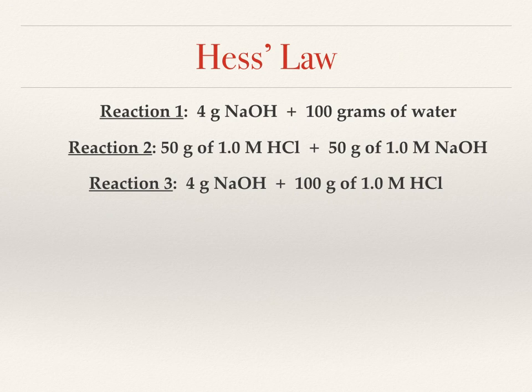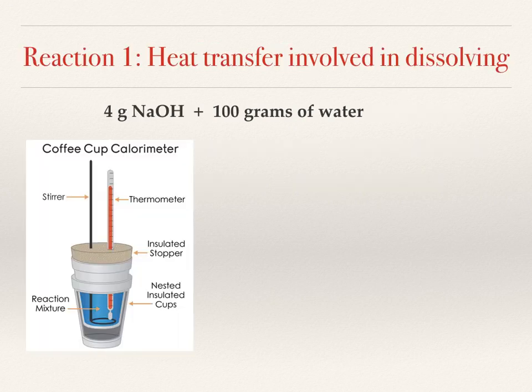We did this in a coffee cup, as is often done in a high school chem lab. It's basically just a reaction vessel that we try to keep as insulated as we can to minimize heat loss to the environment. This data is from a group from Mrs. Bram's class. This is Carolina and Renee, so thanks in advance for all the data here.